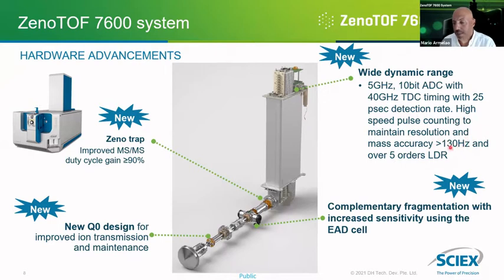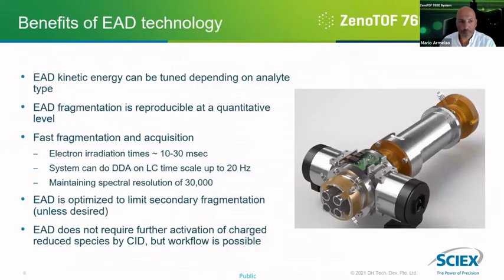So this refers to a MS acquisition rate, and that's sampling rate. So that's counting all the times, which means that to achieve 130 hertz, we're accumulating at 5 milliseconds at MS level. And you may think, okay, so 5 milliseconds is exactly the same accumulation time that is common to find in MRMs in triple quadrupoles. How can you do that at the MS level? And this is explained by the novelty part of the system, which I will highlight right now.